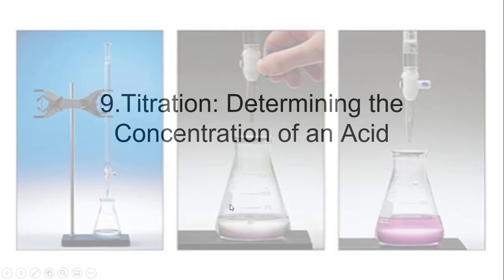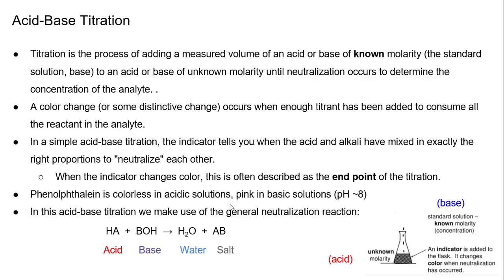Hi class, today's lab is titration, determining the concentration of an acid. Acid-base titration. Titration is the process of adding a measured volume of an acid or base of known molarity to an acid or base of an unknown molarity until neutralization occurs to determine the concentration of the analyte.